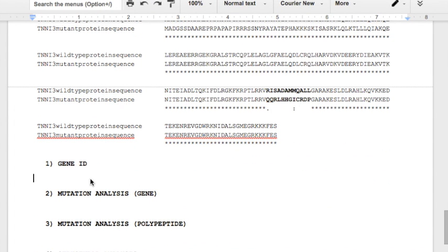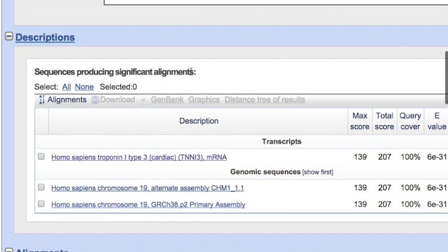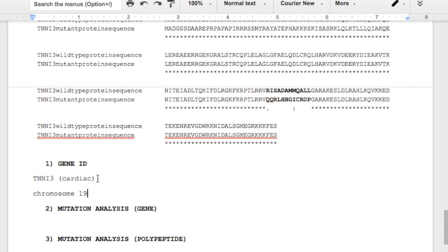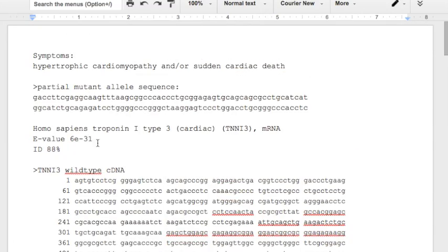Okay, before we get too far, let's collect all the information we've generated in the last 13 minutes and just see what we've gotten. So first, the gene has been ID'd as TNNI3 cardiac type. We've also noted that it's on chromosome 19, and if you don't remember where that information is, it's found right here on the BLAST results page. Second, we identified that there was 88% identity between the mutant allele sequence and the wild type sequence, and that the E value was, I believe, 6 times E to the 10 to the negative 31st, and I can double check that up here, and there it is.